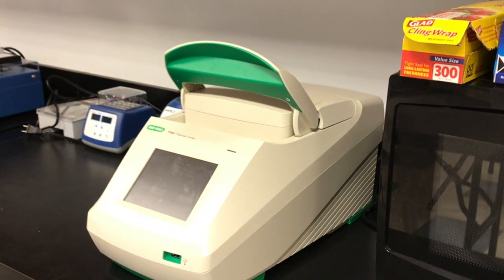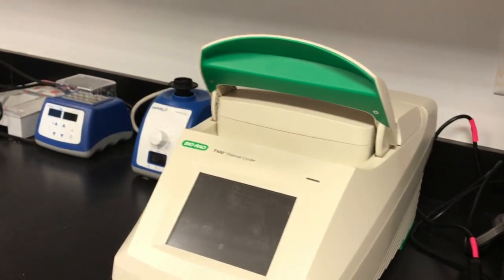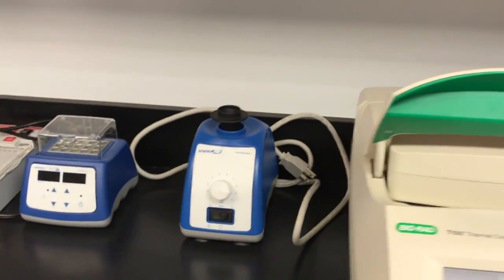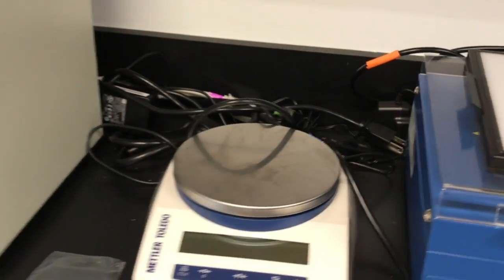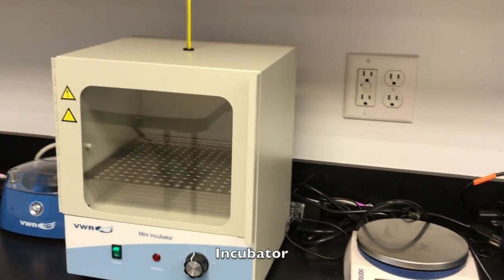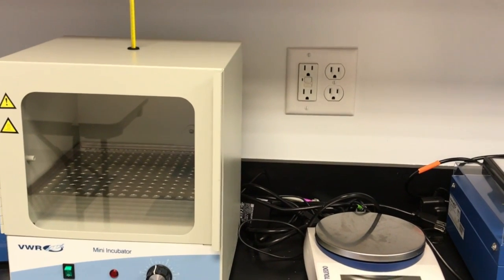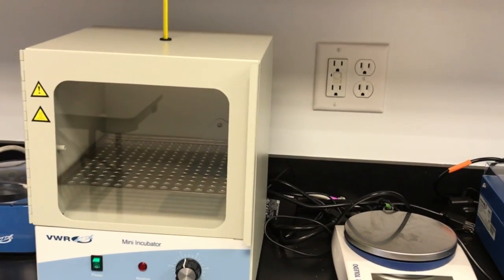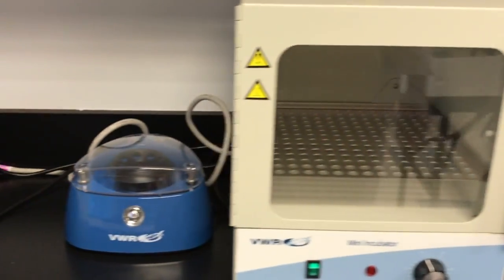Next to the microwave is a PCR machine. A PCR machine is used to copy DNA and make many copies of it. You might have heard of it because right now it's in the news a lot because of coronavirus testing — so this is one of those machines. Next to it we have another vortex, a heating block to keep samples at certain temperatures, a light source, another scale, and an incubator where you can put samples in to have them grow at certain temperatures.